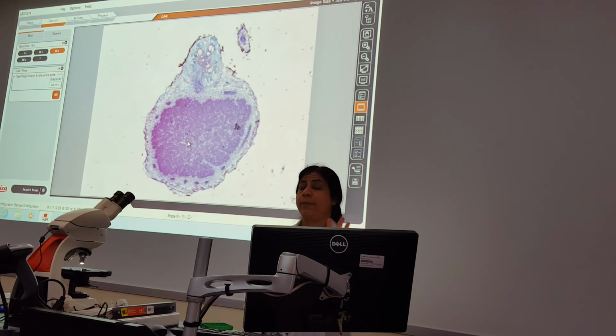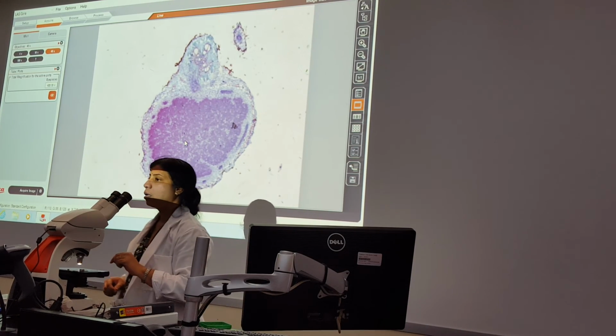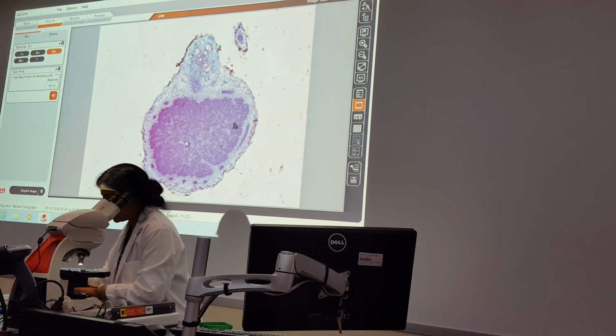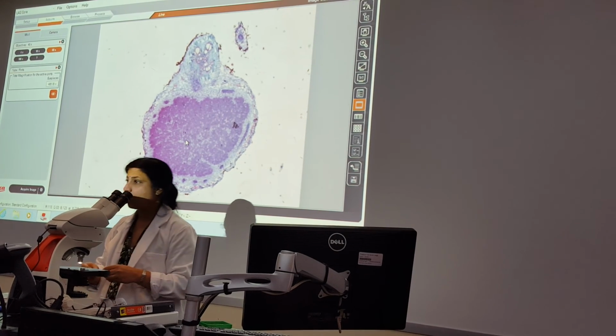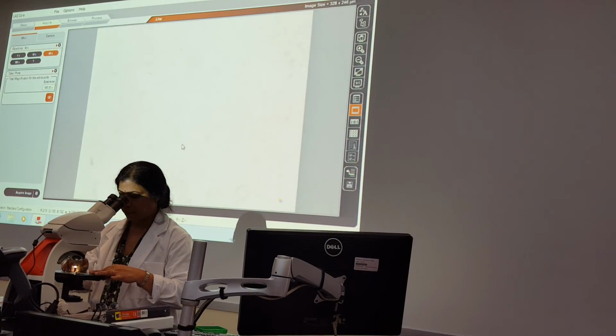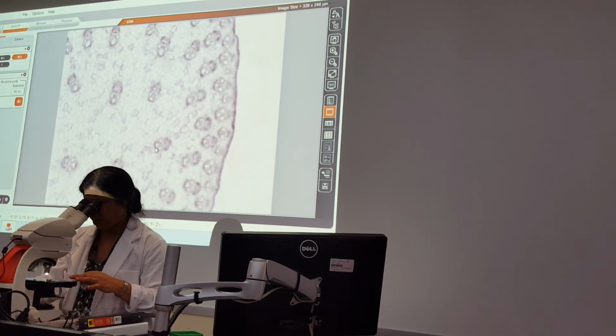What is a plant getting from the bacteria? Nitrogen. Yes. What is this slide, guys? Legume root nodule. I'm not having much time, but I'll do one and then let's see if you can identify.